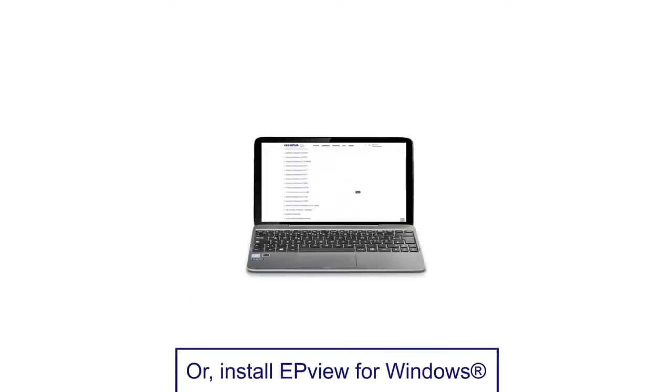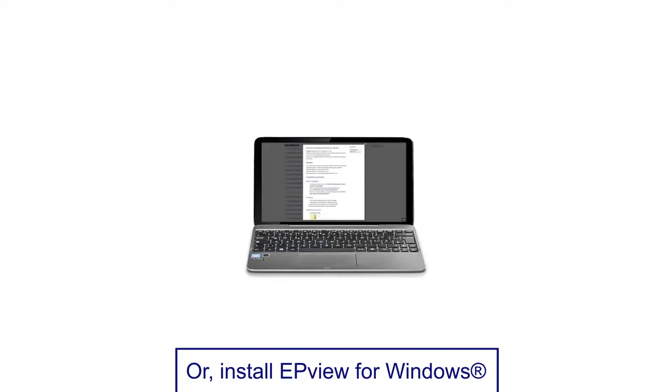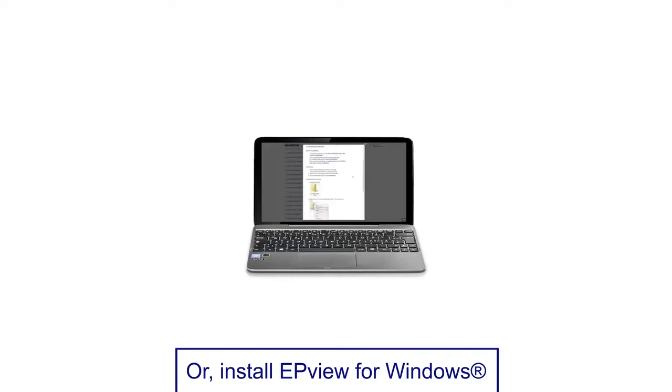If you have a PC or laptop with a Windows operating system, install EP View for Windows, which is available for download on the Olympus website.